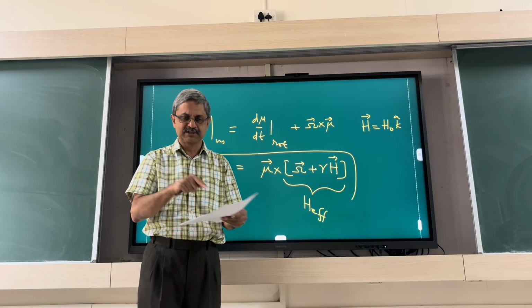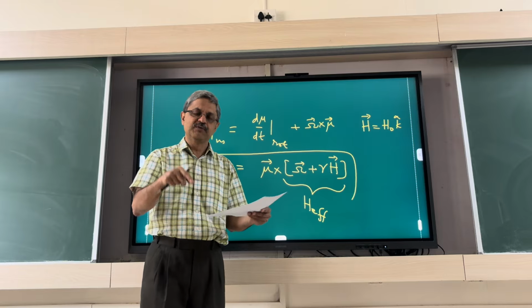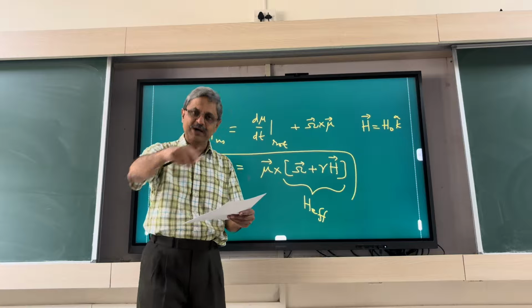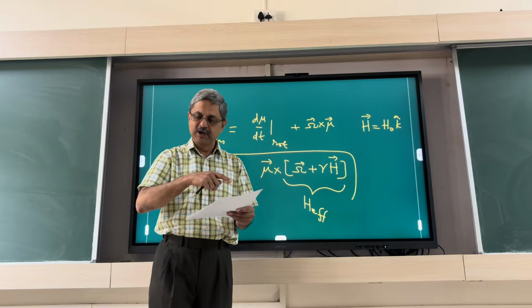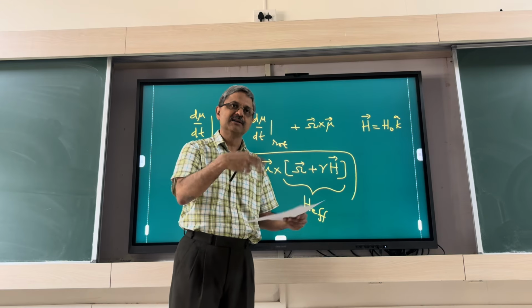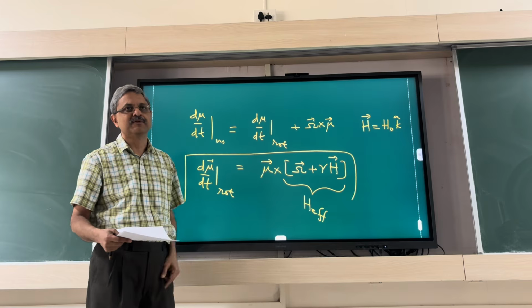Just as I said, if you have a vector which is not changing with time, then in the rotating frame it will rotate by omega r. Likewise, if something is going by omega with r fixed, then if you go to a rotating frame with that omega, you'll see it at rest. So that's what the magnetic moment vector does, you'll see it at rest in a rotating frame.